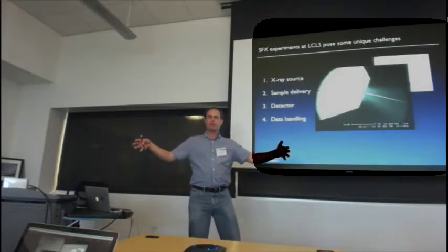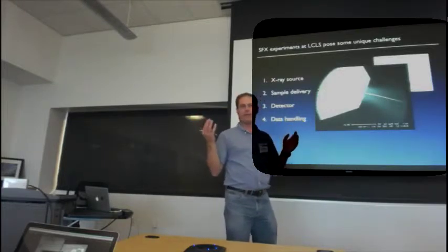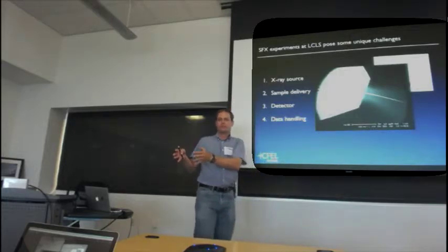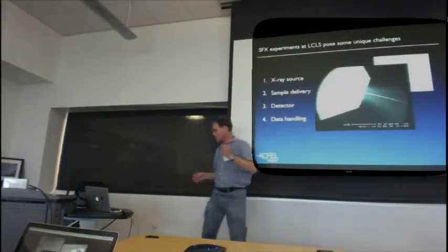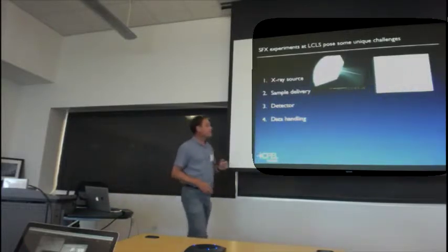You try to do that moderately quickly so that as soon as possible you get rid of all the frames that don't have anything interesting in it, and then you invest your time in the ones that actually do. There's no point trying to do crystal indexing on something without Bragg peaks. Okay. So that's one of the things with the pre-processing.